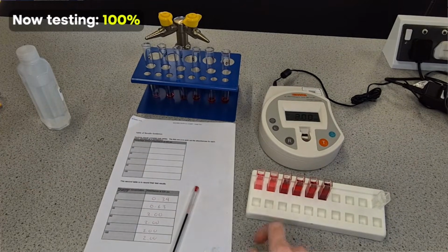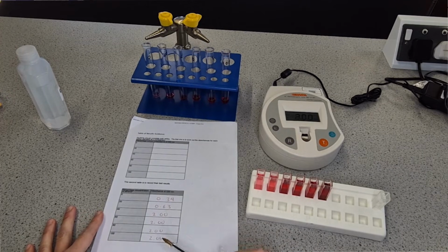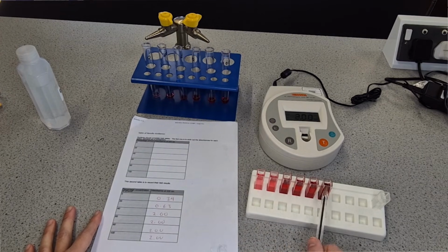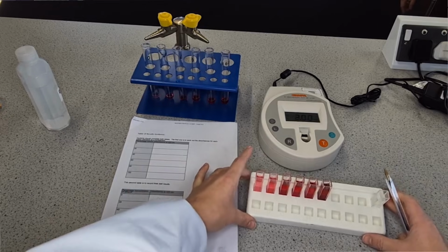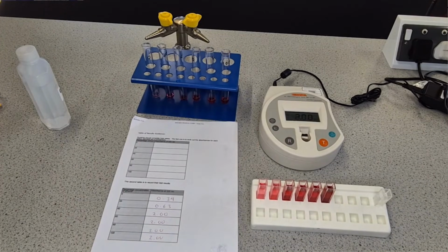So the 4 samples that I said looked to the eye to be the same colour did actually come out as the same absorbance, but I do think this one is the darkest if we have a look at it, but it's capped or it's reached that maximum that it can get to, which is 2.